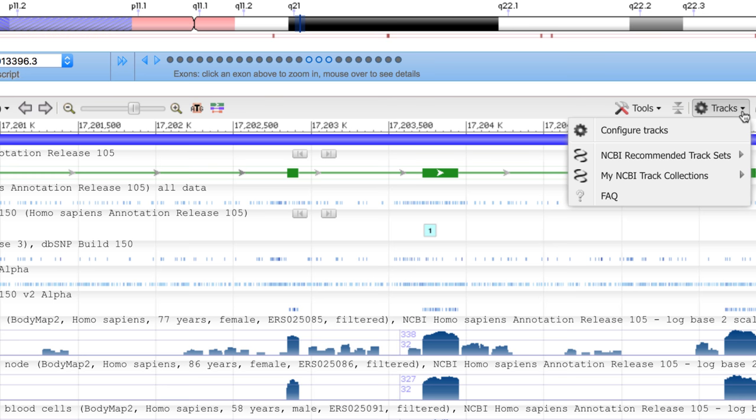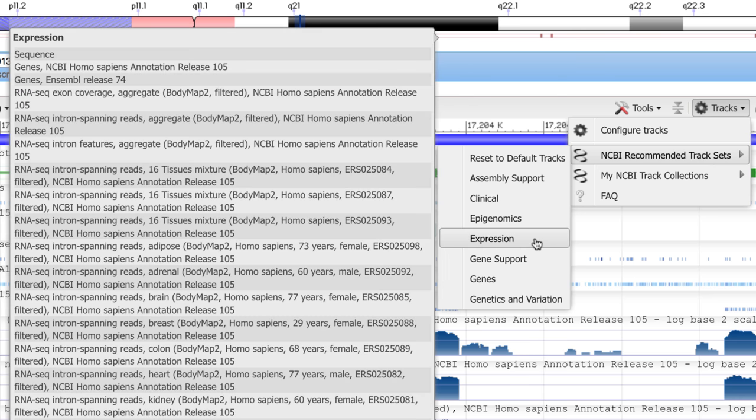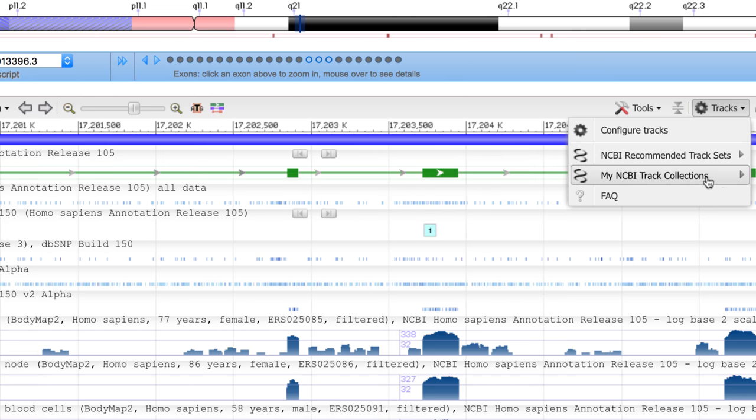You can load predefined sets of tracks, either NCBI recommended track sets for specific topics, or save and manage your own sets of tracks within your My NCBI account.